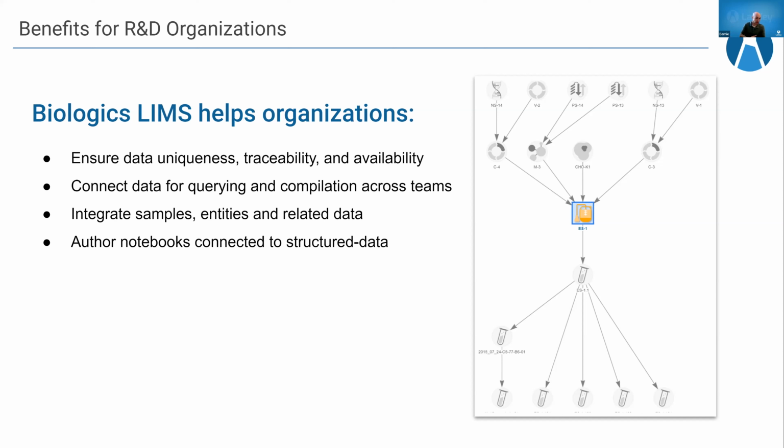Before, you might have had to hire Sherlock Holmes at some kind of obscene hourly rate to help you produce a client report or a regulatory submission. But with our Biologics LIMS, you can let that detective atrophy in his parlor, which is good.